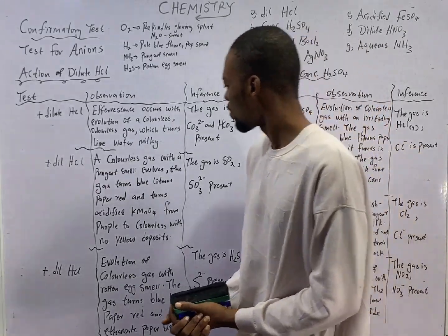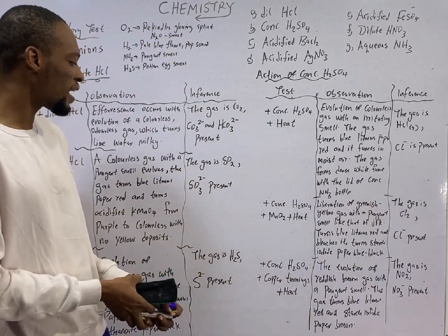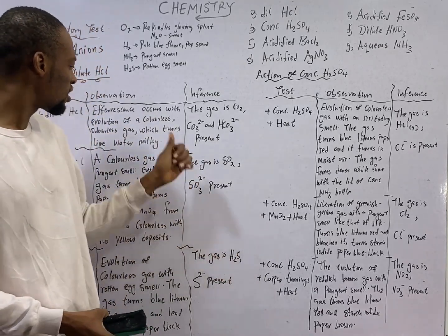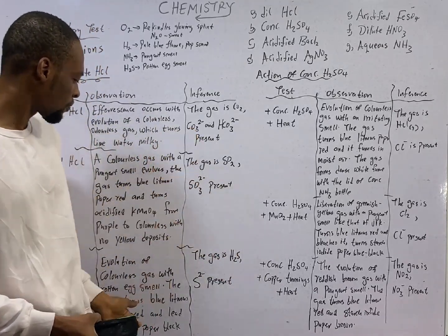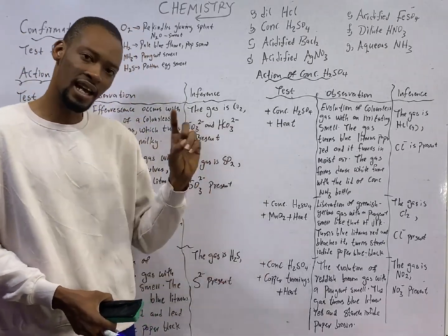Immediately you hear rotten egg smell, then hydrogen sulfide gas should come to your mind. It is all these keywords you should look at. Turns lime water milky, that is CO2. Rotten egg smell, that is H2S, the gas present.